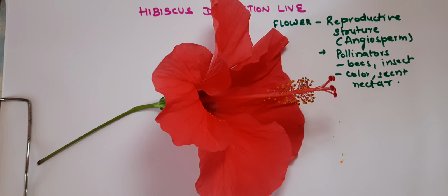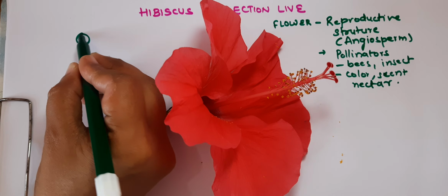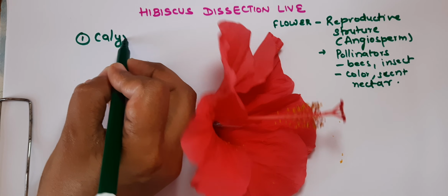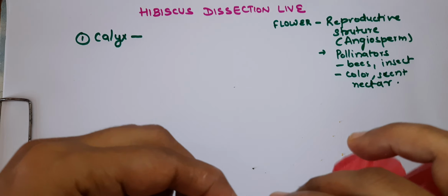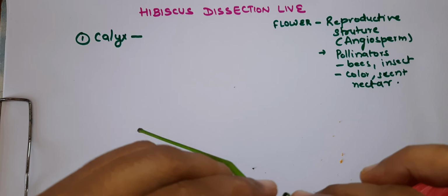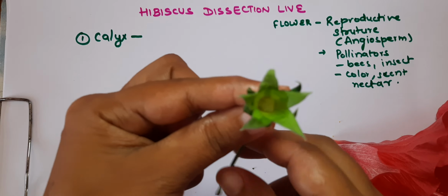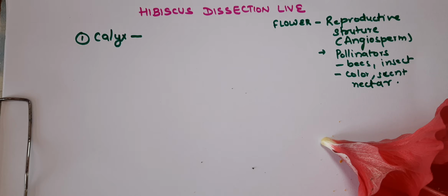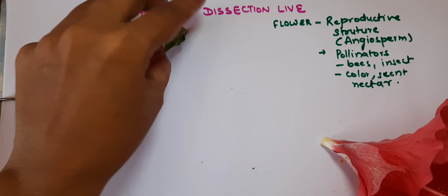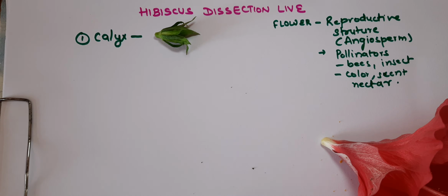So now let's learn about the calyx. Let's separate the calyx first. Students, this is the calyx. I will just keep it here. So this portion is known as the calyx.